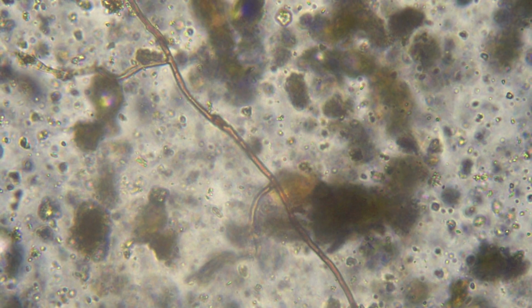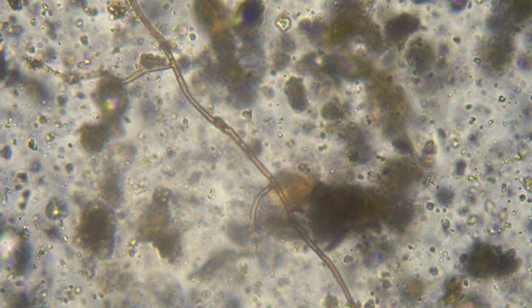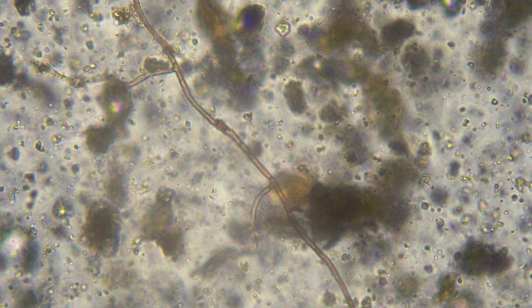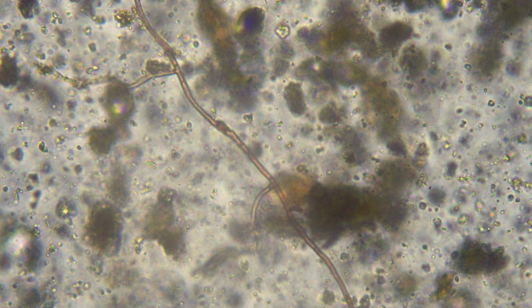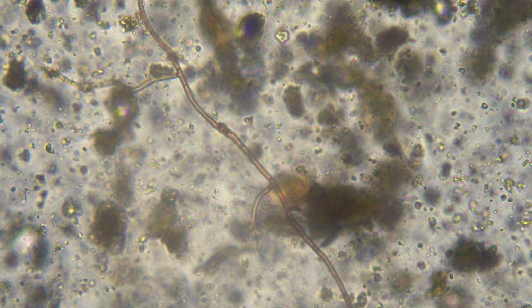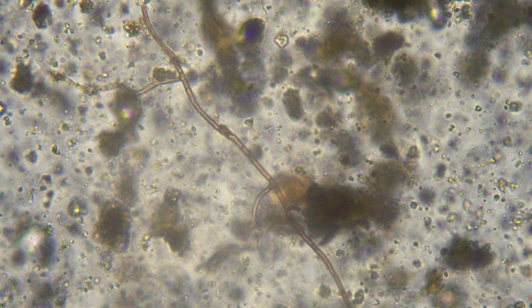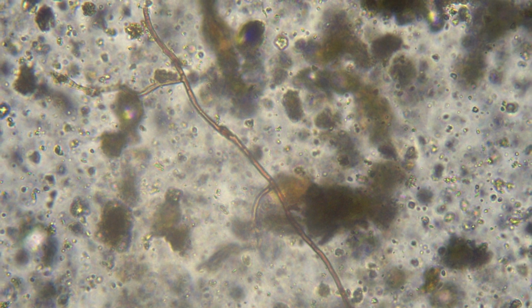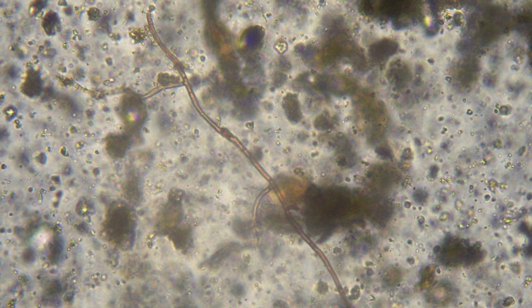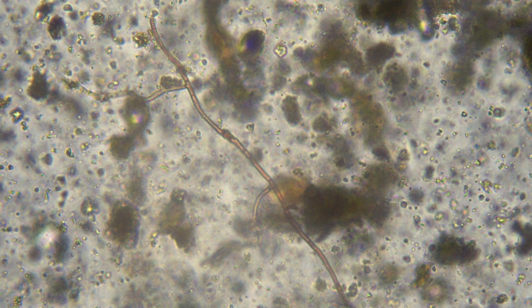Here we can see an even bigger strand of fungal hyphae. Again, it's got that similar light brownish color, but we can see the mycelium threads growing out and branching off in amongst all the particles of soil. And I think this demonstrates how certain organisms can move through soil and also how they tend to congregate around organic matter, which is why it's so important to feed your soil, not just your plants.